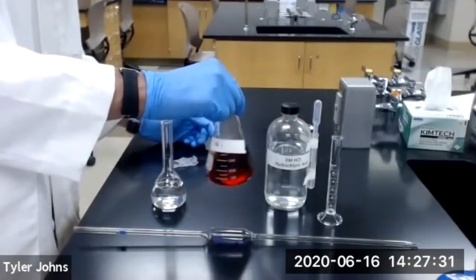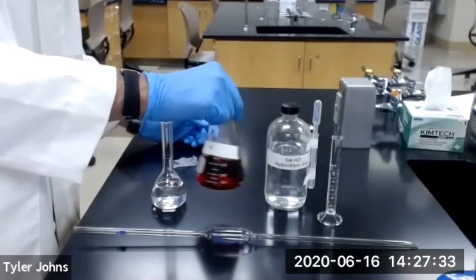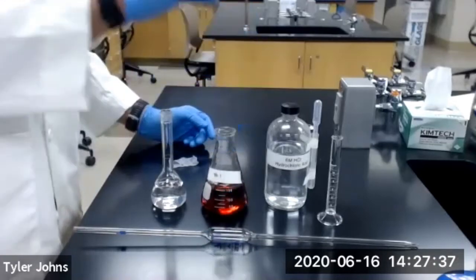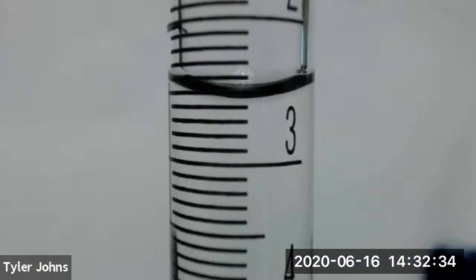And immediately after mixing, we're going to start titration using flask number 1. This is our initial volume in the burette. Make sure to record the initial volume on your data sheet to the correct number of significant figures. Note that we are just over 2.5 milliliters, but you need to have the correct number of significant figures.